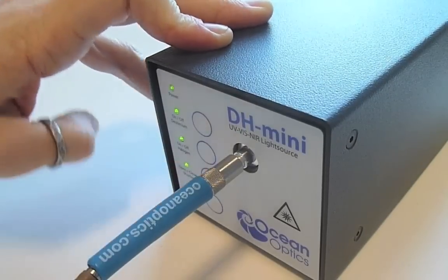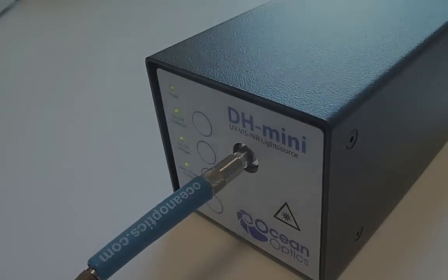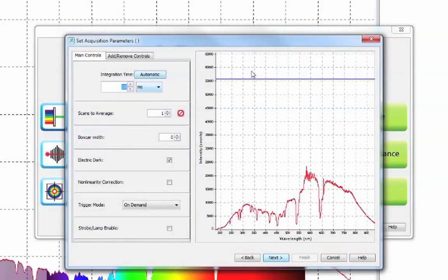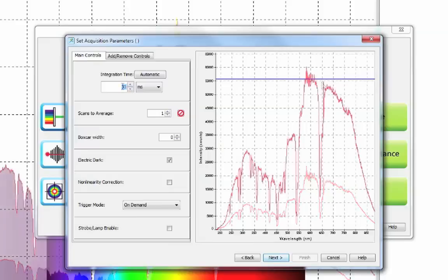You will want the highest point on your spectrum to reach up to about 85% of the maximum signal that your spectrometer can receive without saturating. This is indicated by the blue line shown here.